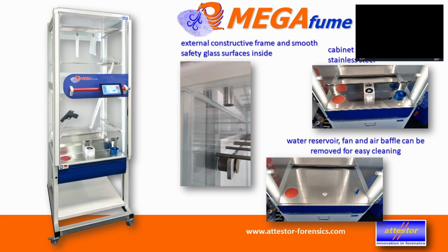Sorry, I was too far. The bottom we didn't dare to make from glass. If someone lets something drop down and the glass smashes, then it's not so easy to clean anymore. So the bottom is actually made from a high-grade stainless steel.